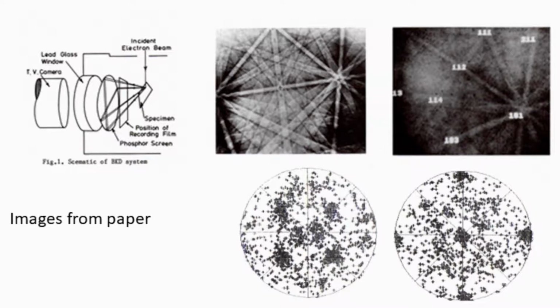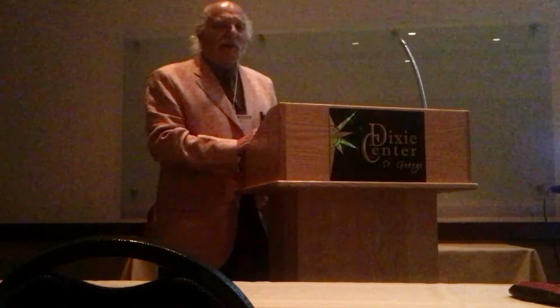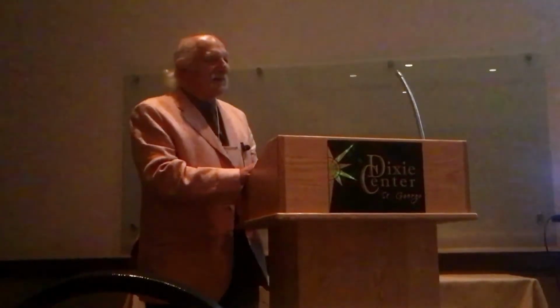And one feature that's in there that hasn't been used very much is the way you represent orientations. The opening paper of that meeting was by Professor Sir Charles Frank, and he said it's ludicrous that the community uses Euler space to represent orientation. Euler himself, in his second paper, said don't use it. It's a ridiculous way of representing orientation. Use the Rodrigues method. Now, it's known as the Frank-Rodrigues method, but nobody uses it. I'm afraid 30 years later, very, very few. But it was included in this paper, but I just didn't have room on the slide to show you what it looks like.